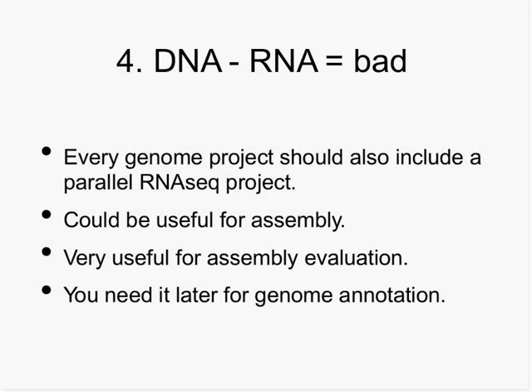After you do your assembly, it's incredibly useful for assembly evaluation. We're going to talk about that a little bit later. And you do need it later for genome annotation. As much as you might want to bank on previous proteins that have been annotated or gene prediction algorithms or something like that, honestly, the best source of genome annotation information is going to come from aligning full-length transcripts or virtual full-length transcripts back to your genome. Always include RNA-seq in your genome project.